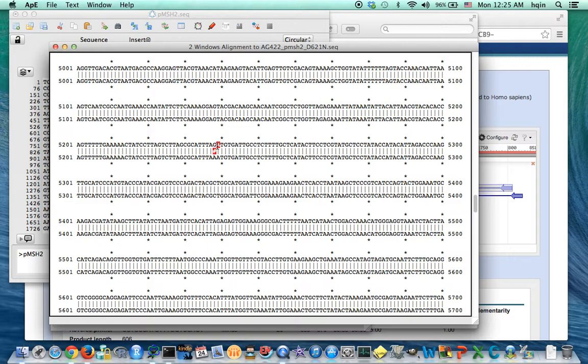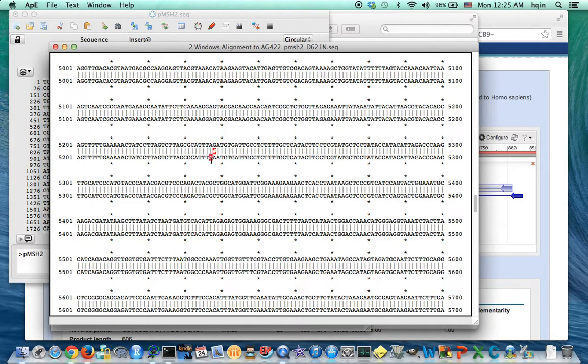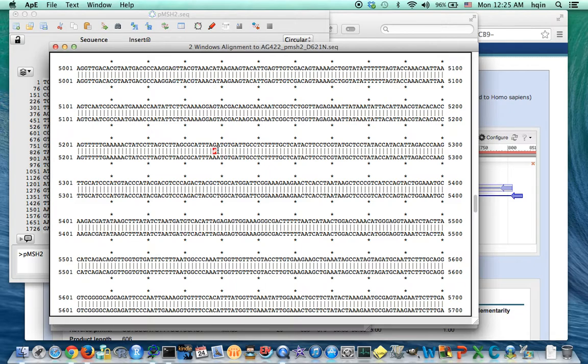So I want to design a primer that can amplify this region. I want my PCR fragment to be about 800 base pairs. This way when I use my restriction enzyme that can distinguish the wild type from mutant and cut around this region, I can have two fragments. So the original fragment may be 800, and then I cut it, it's going to become two fragments around 400 base pairs.